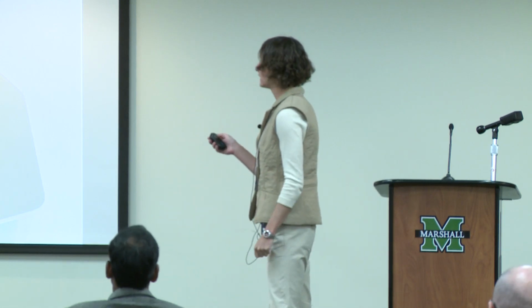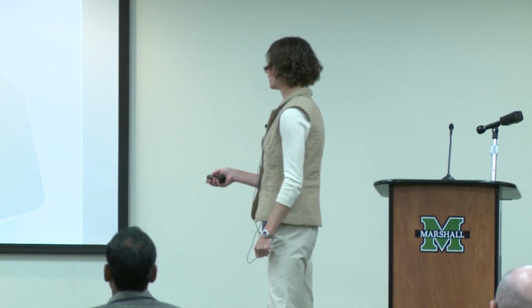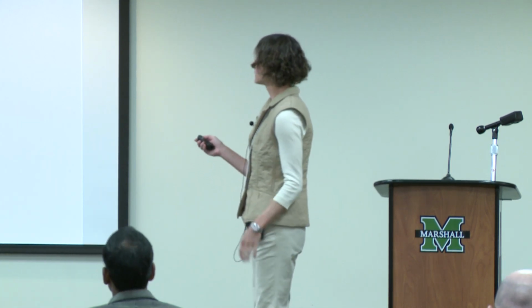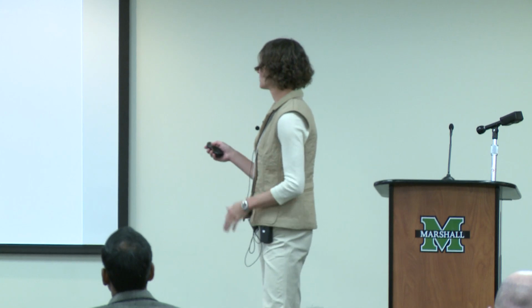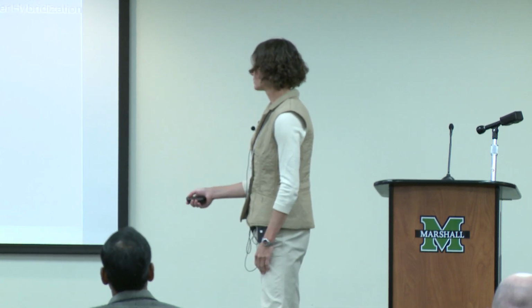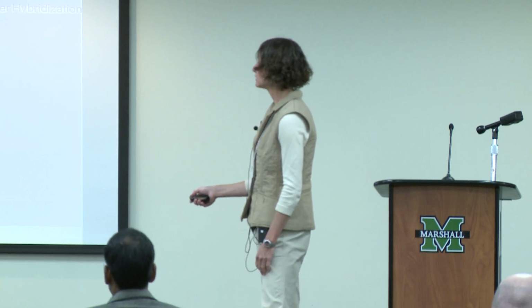So the second phase is to amplify each of these individual fragments in the library in a spatially restricted way, and you'll see why that's important. This is all done on a machine, which I was showing you there. It's called the CBOT. Again, this process can be broken down into 4 steps as well, and it is all accomplished on a flow cell that goes into that instrument.